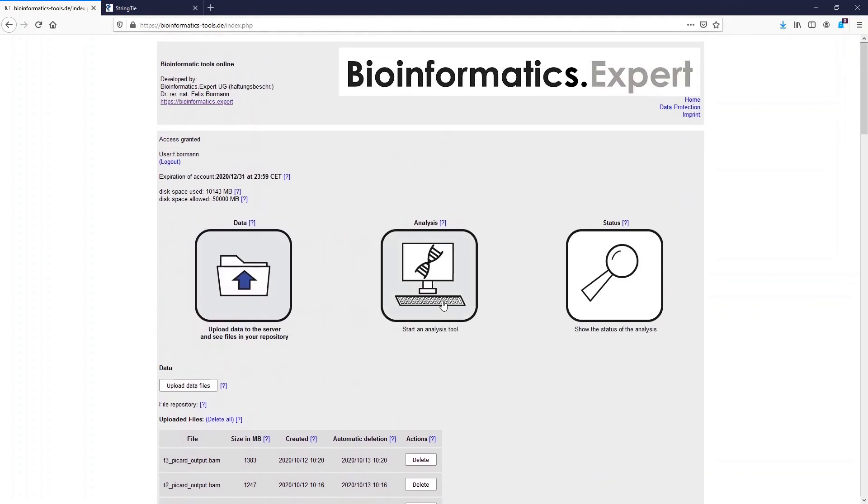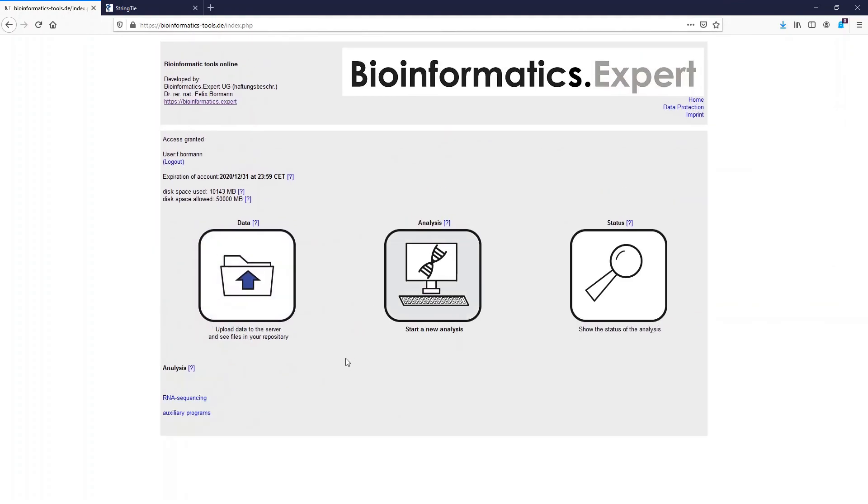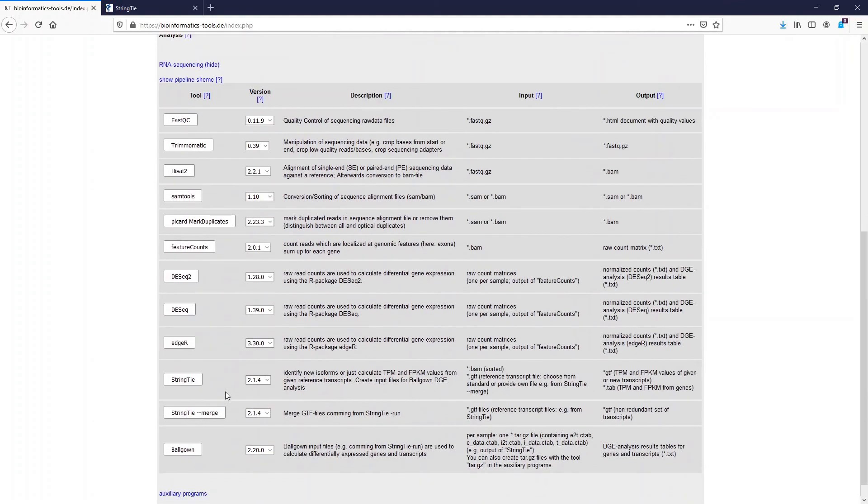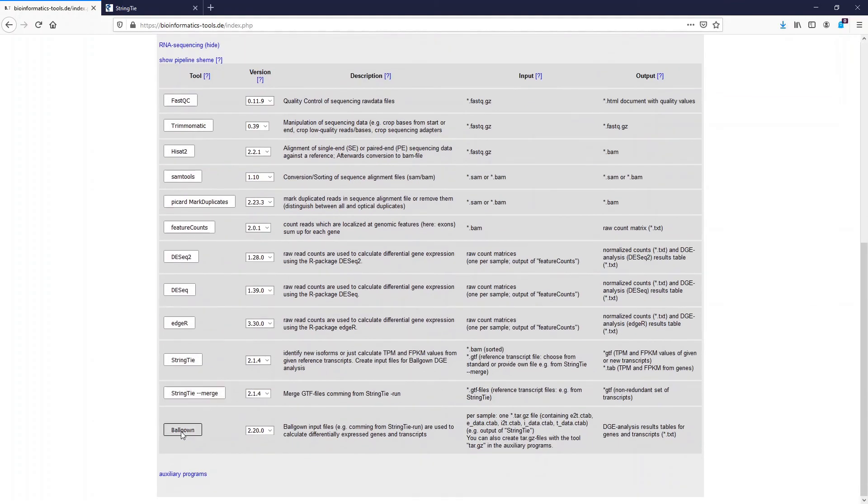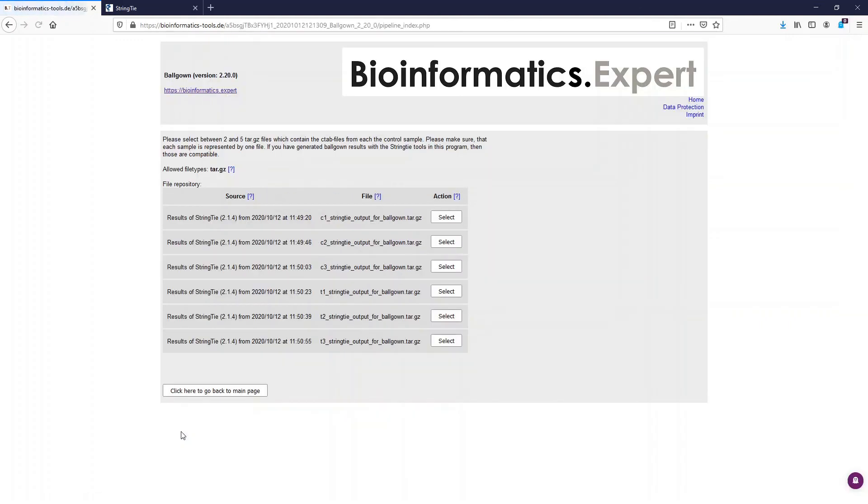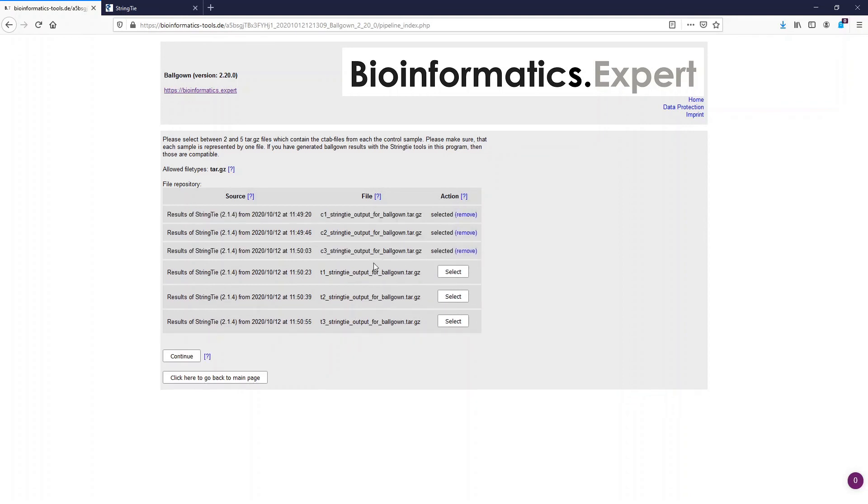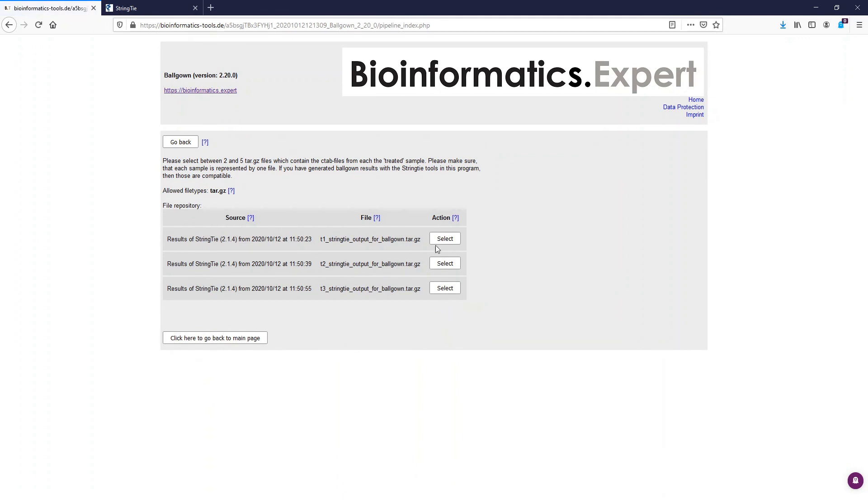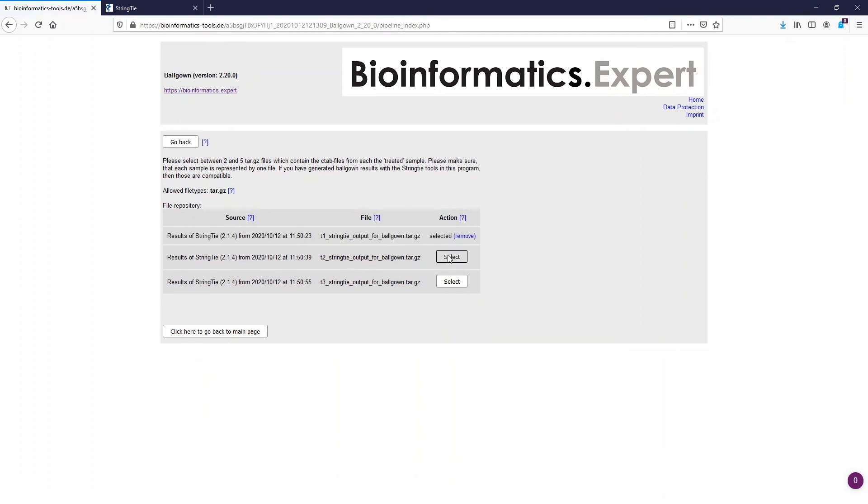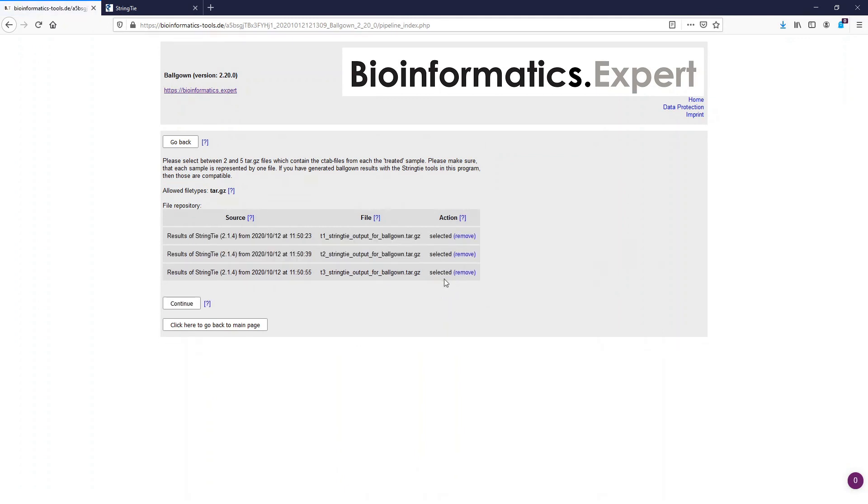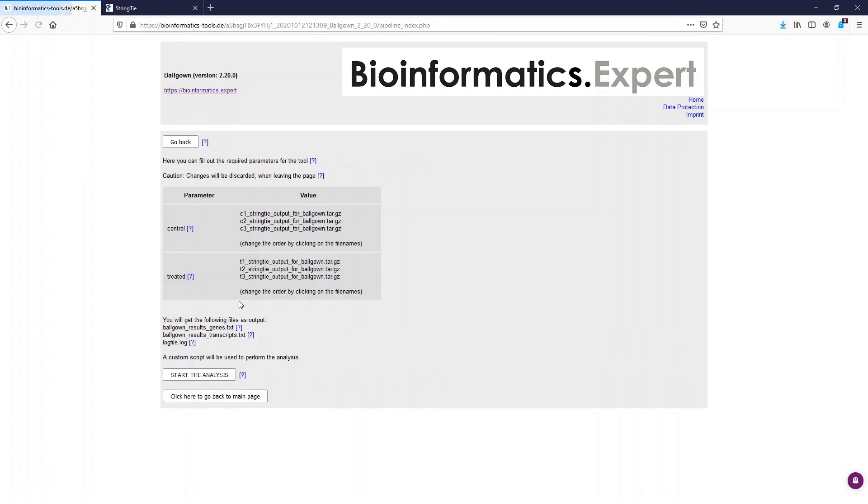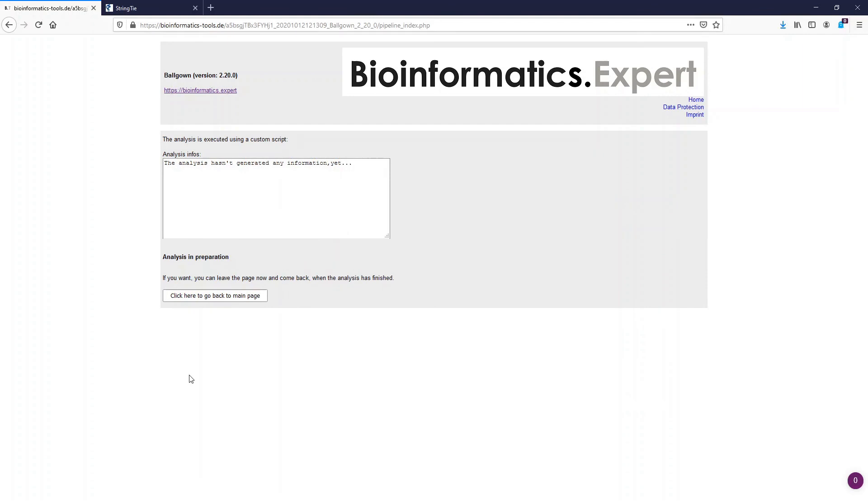Now we can start the Ballgown run. Similar as in the differential gene expression analysis video, we first have to select the files which contain the results of the control samples. Now we have to select the files containing the treated samples. And now we just start the analysis by clicking this button.